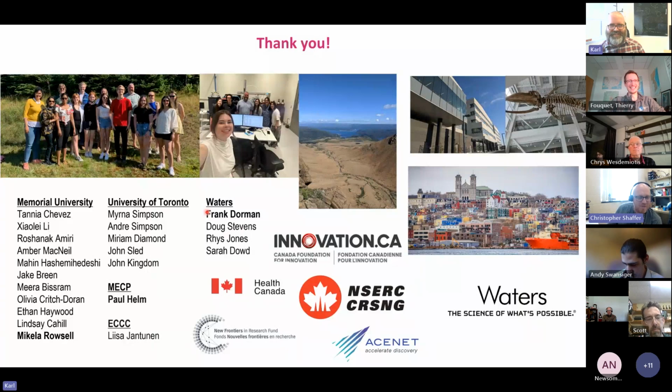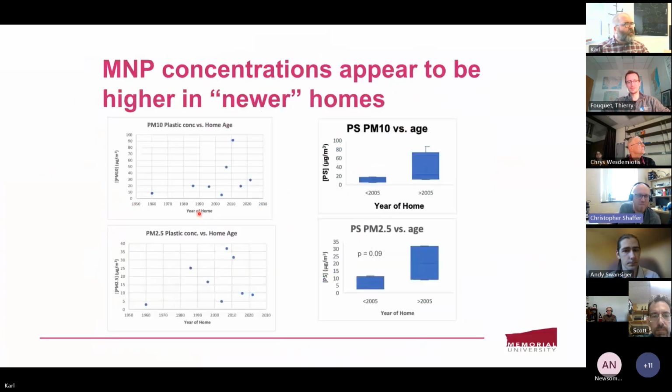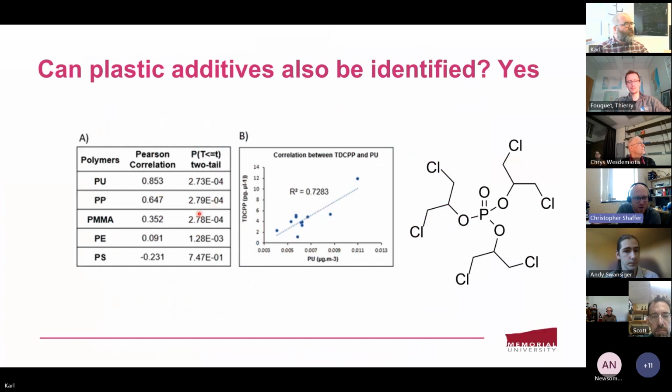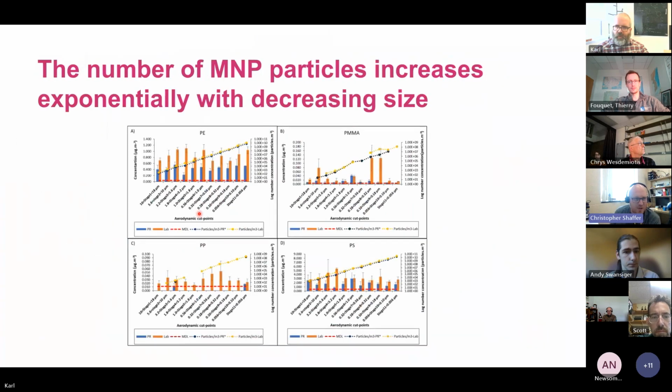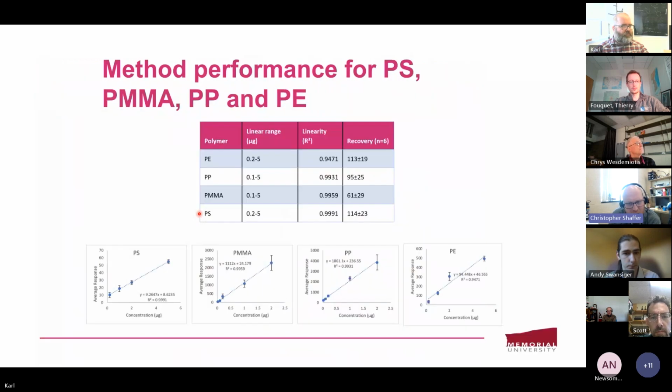But if you can go back to that slide, my question would be about the process of your quantification. You're doing that based off of mass balance, essentially, right? The total response, based off of concentration instead of one particular analyte? One more slide back, on how you set up the calibration curves. Is that based off of total response on the chromatogram, or one particular analyte in that?